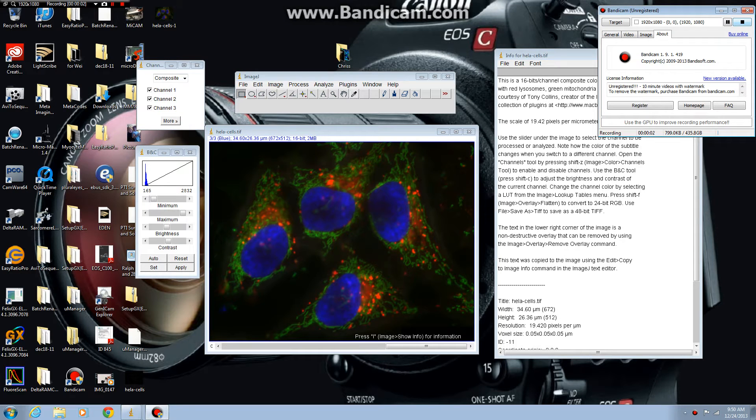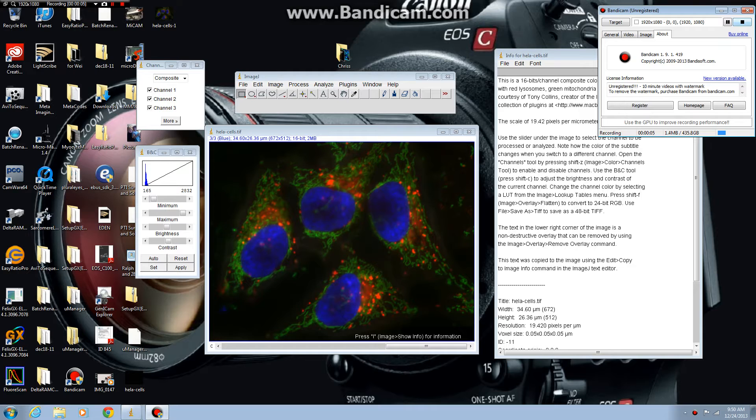The following is a tutorial on commonly asked questions about image processing using ImageJ.